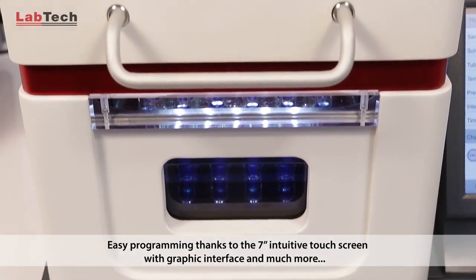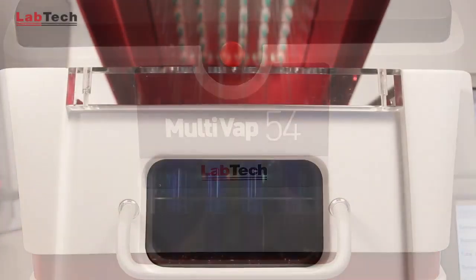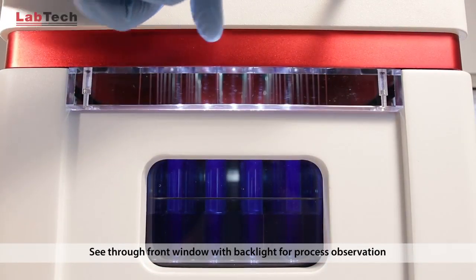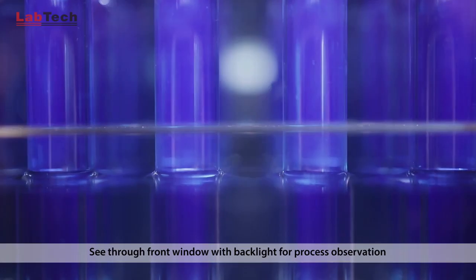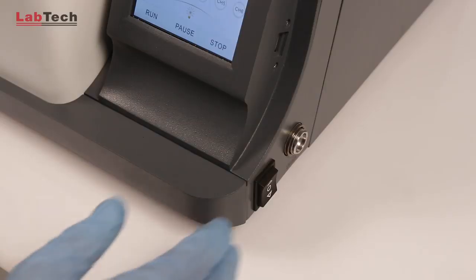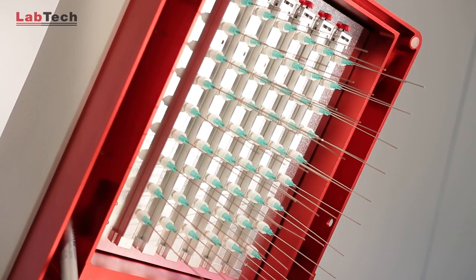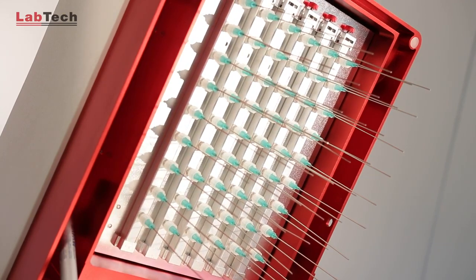The instrument does not need to be constantly monitored, but if the operator wants to see the concentration process, this can be viewed via the backlighted see-through front window. N2 needles can be adjusted either manually or automatically according to the sample volume reduction.